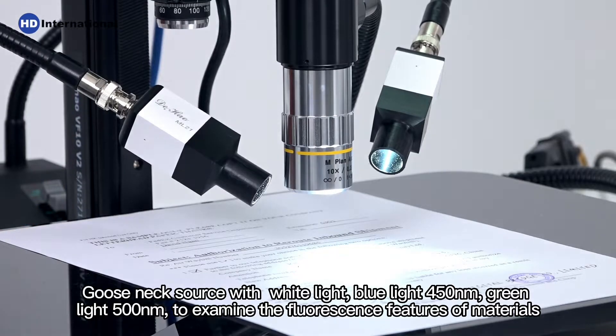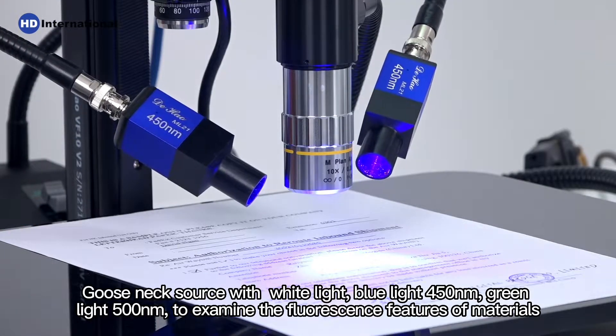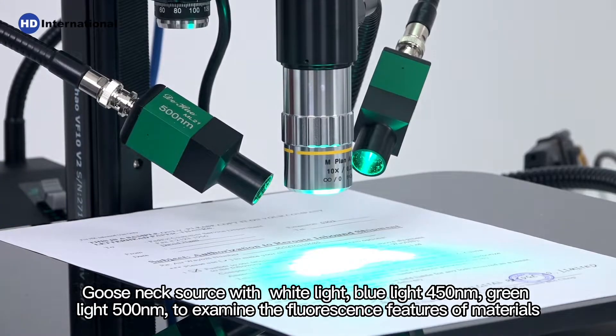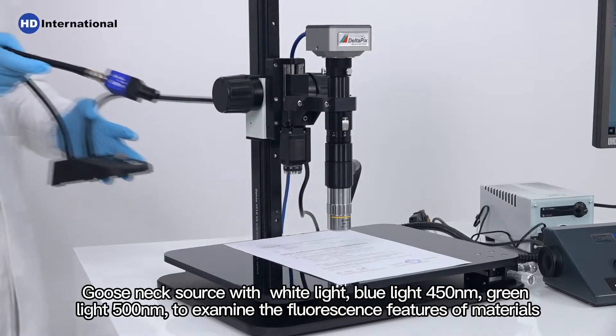The gooseneck source includes white light, blue light at 450 nanometers, and green light at 500 nanometers to examine the fluorescence features of materials.